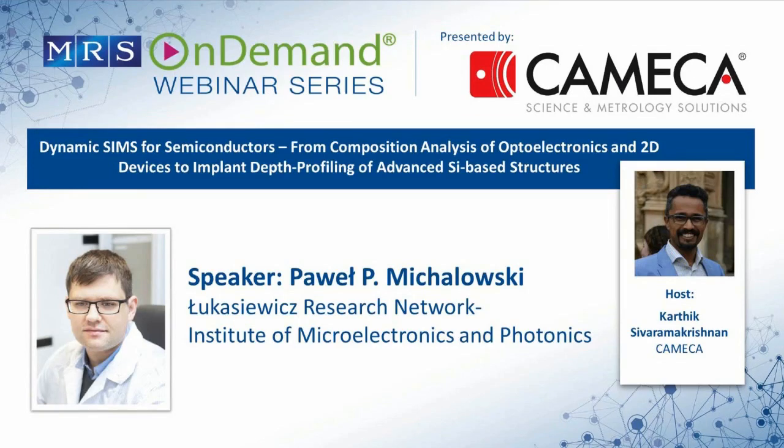Thank you, Dr. Michałowski. The next question that we have is, how do you measure the depth of the signal in dynamic SIMS? And what is your assessment on the accuracy of this measurement?